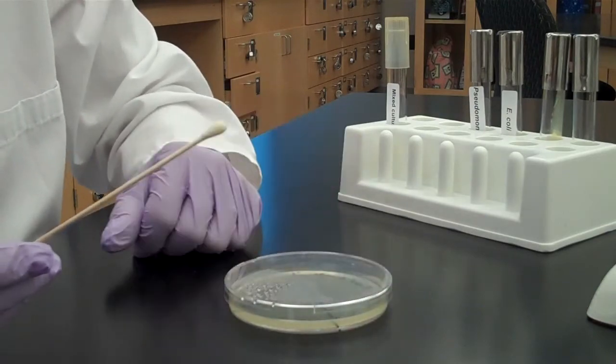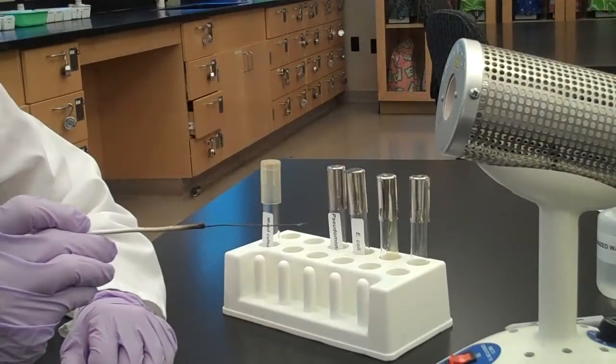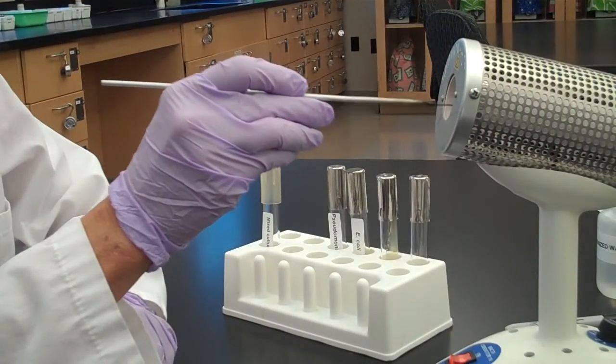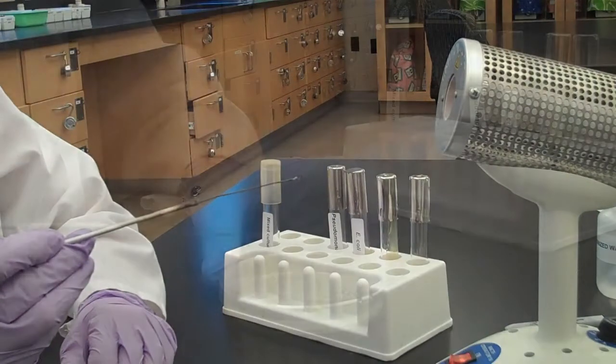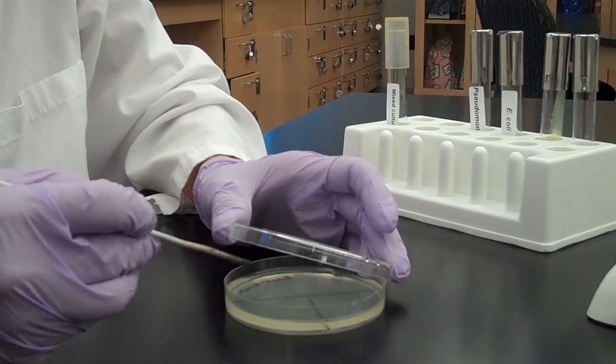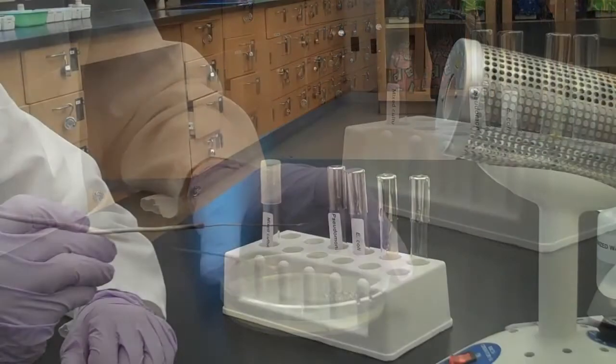Now we're going to switch to a loop for the rest of this streak plate. Sterilize your loop and let it cool. Drag bacteria one time from the middle of section 1 into section 2 and spread it out to fill section 2.